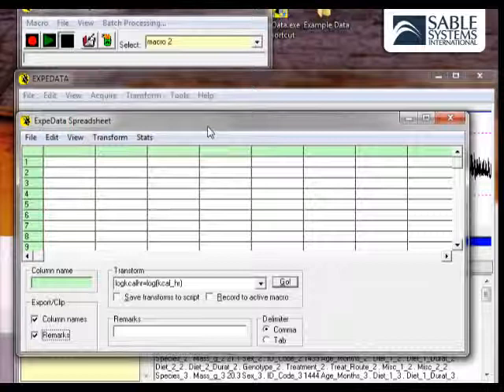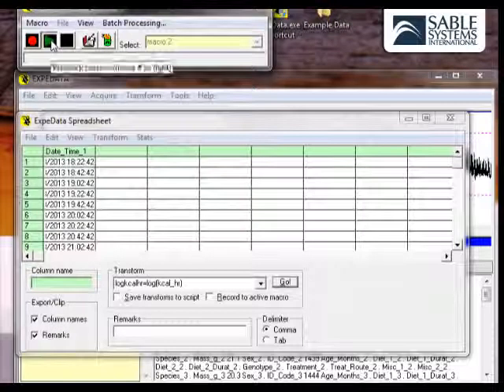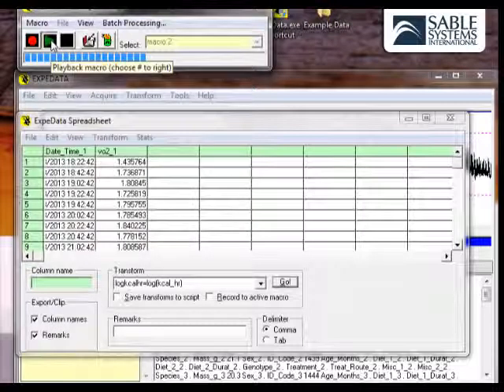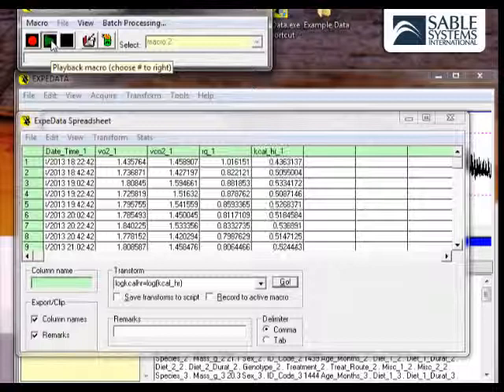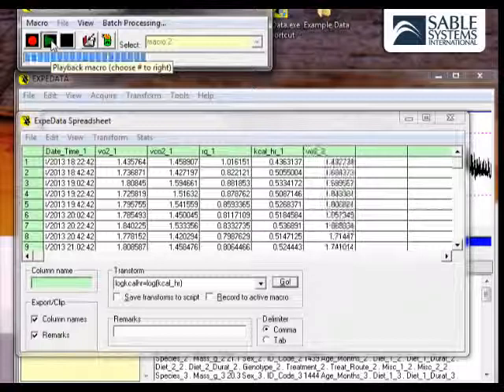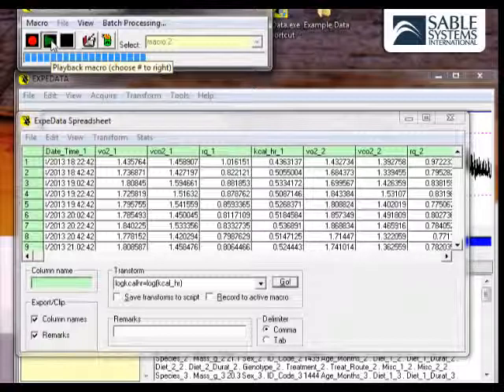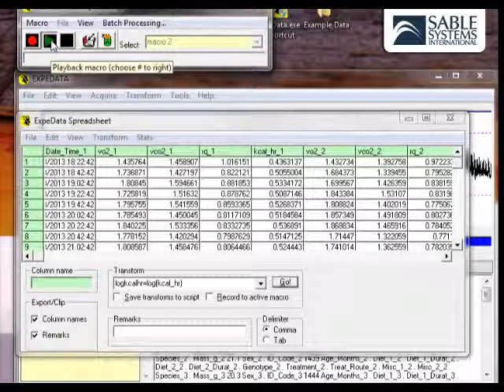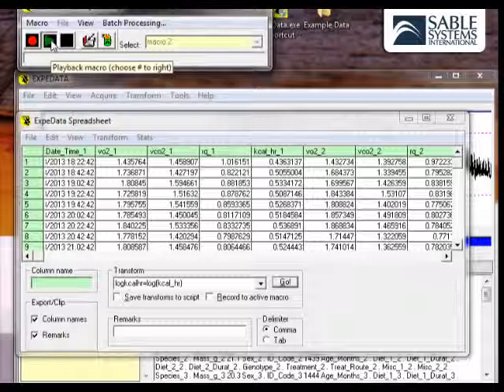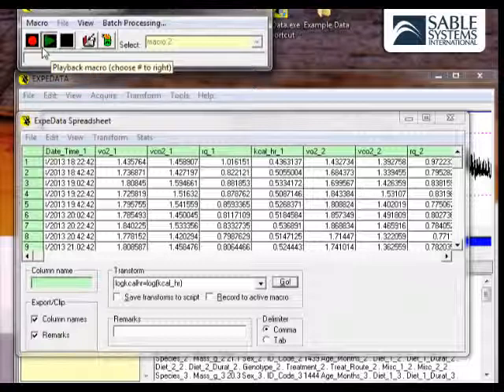Now let's go ahead and run Macro 2. We click on the Play button, and it's extracting, in this case, the date and time and other data from mouse1, v.02, v.co2, the RQ, then from mouse2, and what have you. This macro extracts a great deal of information.